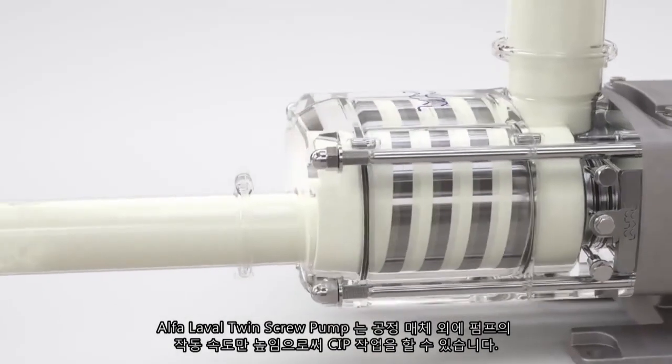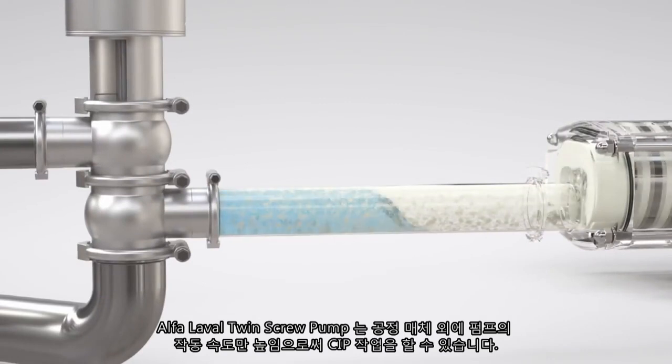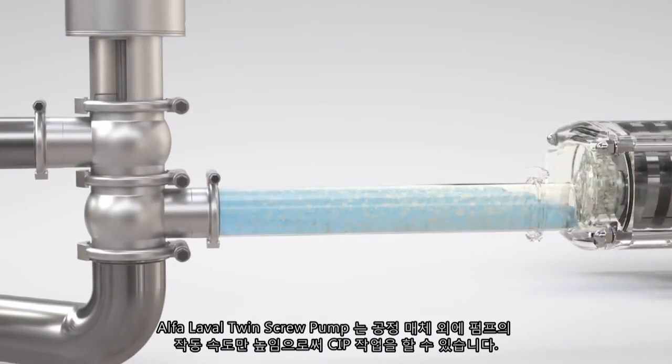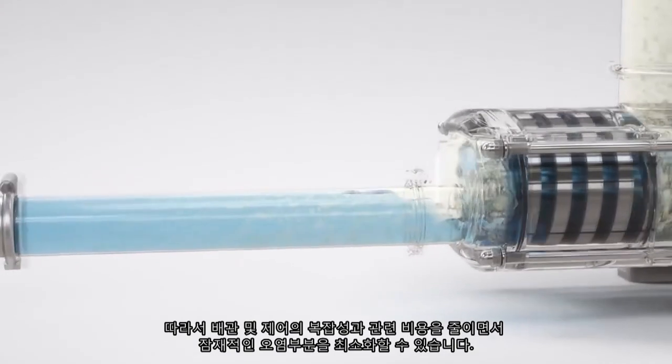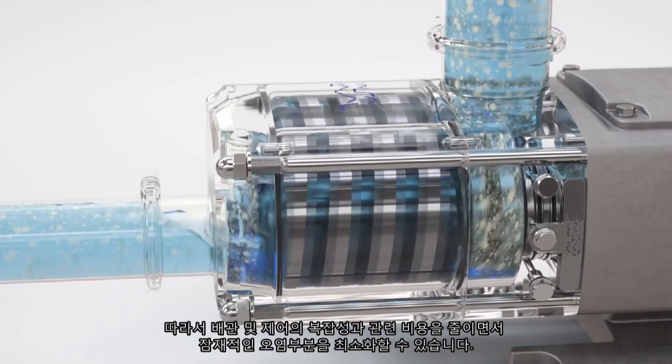In addition to process media, the Alfa Laval twin screw pump can also handle CIP duty by simply increasing pump operation speed. This simplifies piping and control complexity, reducing associated costs whilst minimizing potential contamination points.